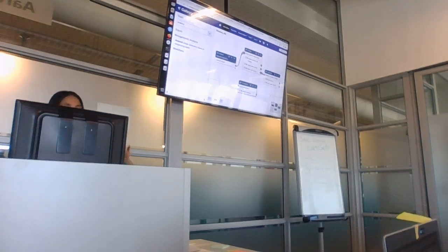If you had a different input here with all your individual files, and obviously you wouldn't add Kraken to this anyway because you'd have to select the dataset. But let's say, for example, you had all your data not as a collection but as individual files. You would drag this into the input. It's actually quite fun, like playing. So you just drag this to here to connect it to Kraken, to tell Kraken it will have to find the dataset there.